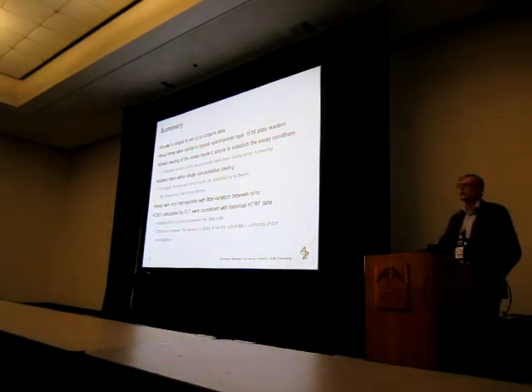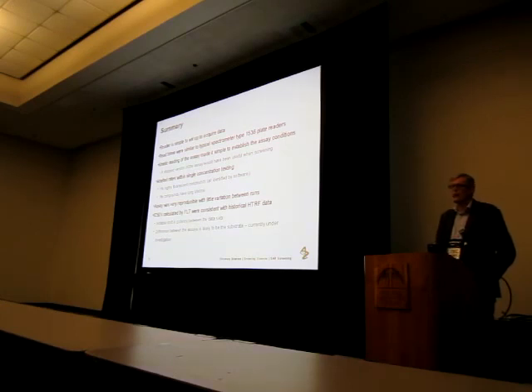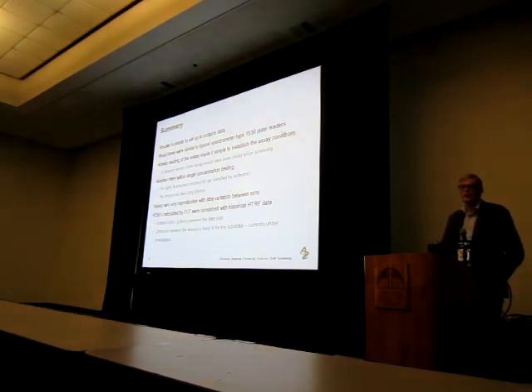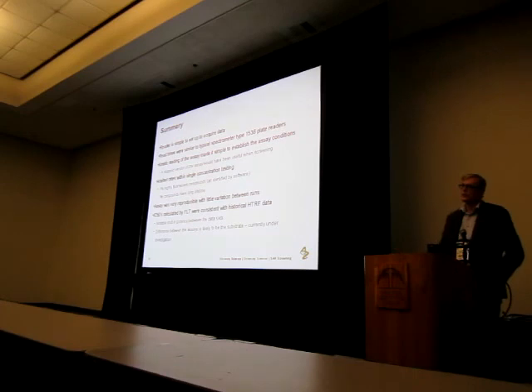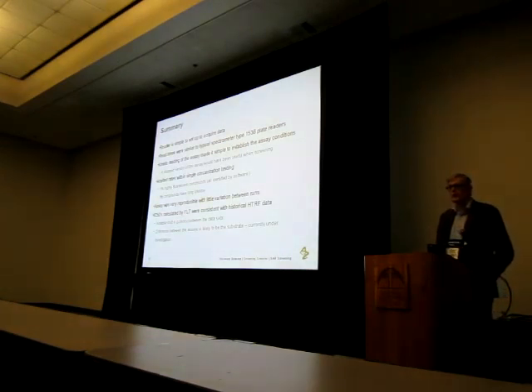So when we've got some handle on that, we'll be able to do some mass spec analysis, for example, where we can take the HTRF assay and maybe the FLT assay, run them, but rather than using the fluorescence detection end, we'll just put them straight down a mass spec and see what the relative proportions of product and substrate really are, and calculate the IC50s that way. And that should then give us a reasonably good handle on where that variability is actually coming from. So that's what we want to do next, to really bring us to a conclusion around that evaluation. So I think that's the last slide.